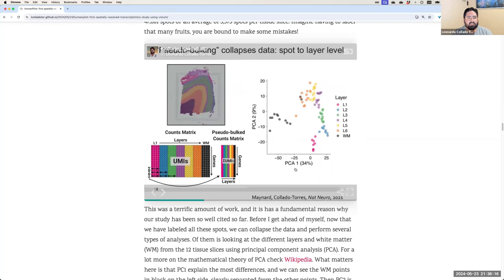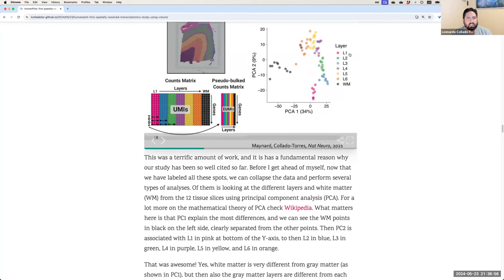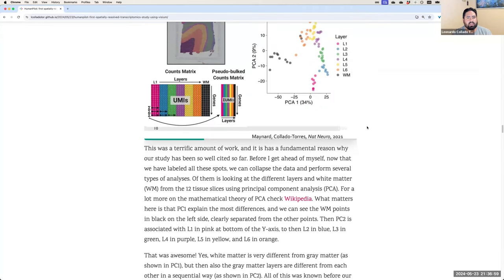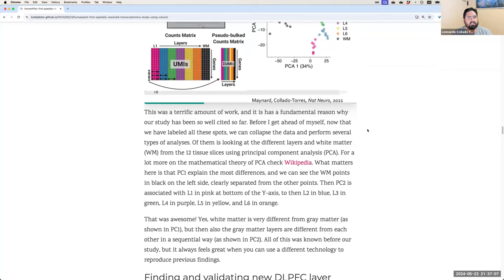Principal component analysis math is complex, but the interpretation is simple. PC1, on the x-axis, explains the most variance: white matter spots are clearly separated from the colored layer spots. On the y-axis, moving from bottom to top, we see layers one through six in sequential order — blue, green, purple, yellow, and orange. This reproduces known biology using the new technology, giving us confidence to move forward.